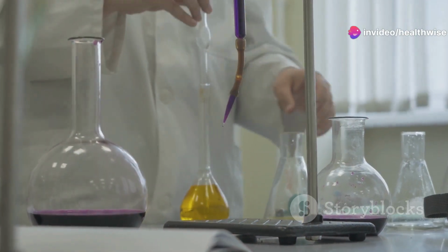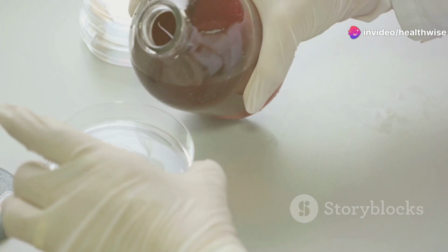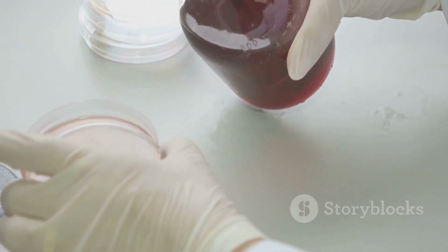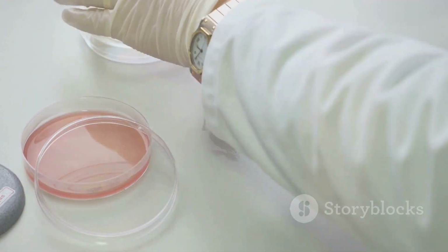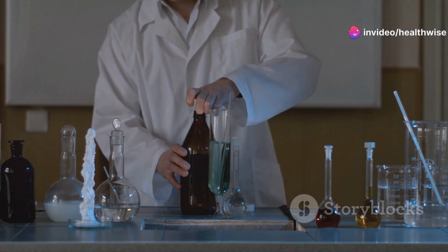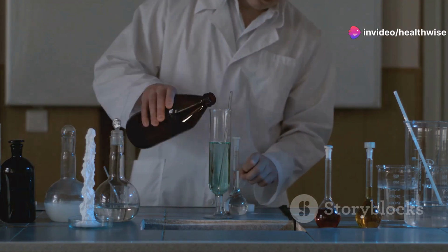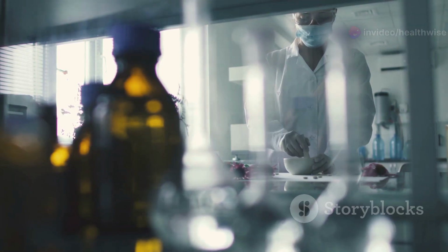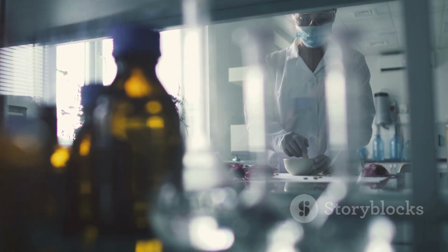Lastly, we have the zinc sulfate flotation procedure. This technique uses the high specific gravity of zinc sulfate to float parasitic cysts and some helminth eggs. Here's a rundown. 1. Prepare a fecal suspension using 1/4 to 1/2 teaspoon in 10 to 15 milliliters of water. 2. Filter this mixture through 2 layers of gauze into a small tube.